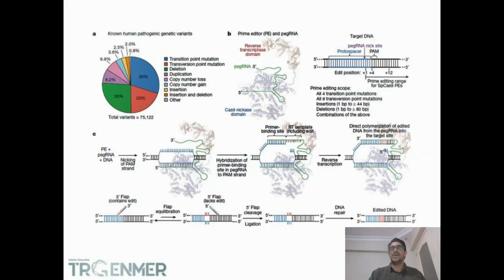With the help of that system, you can not only change a single nucleotide polymorphism, you can even insert or delete any targeted sequences in a single pegRNA.